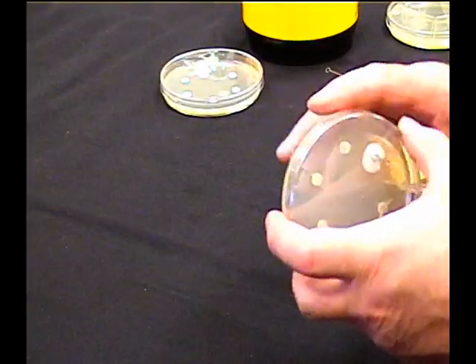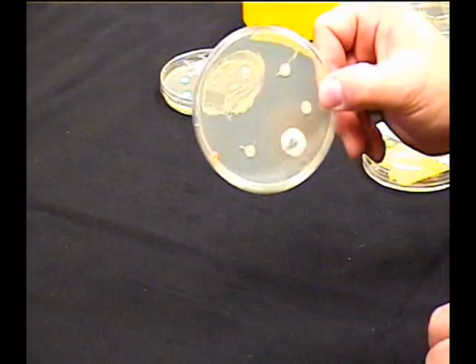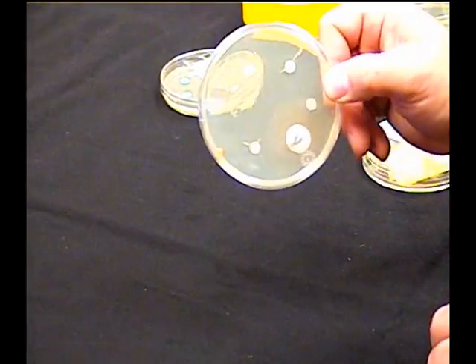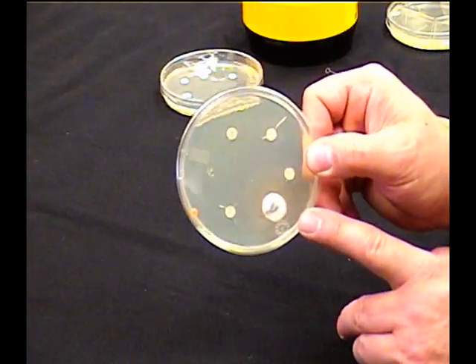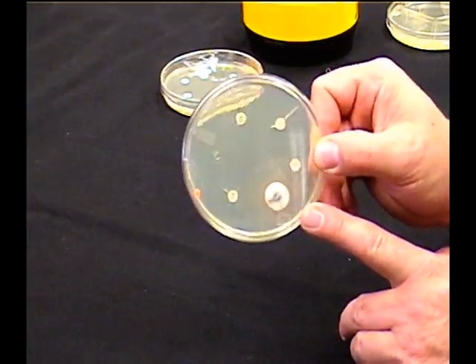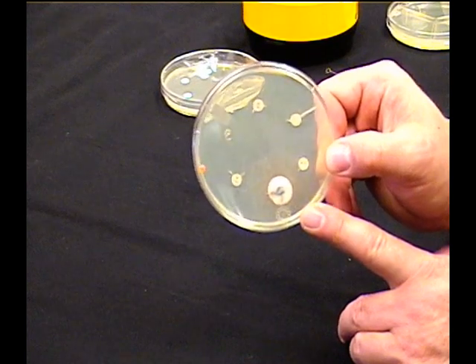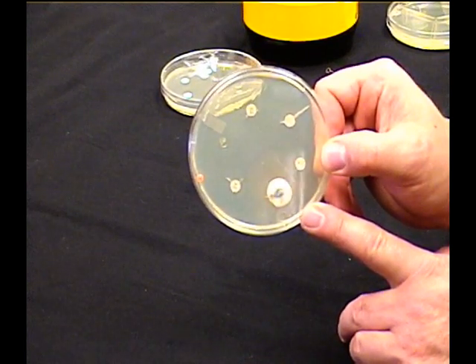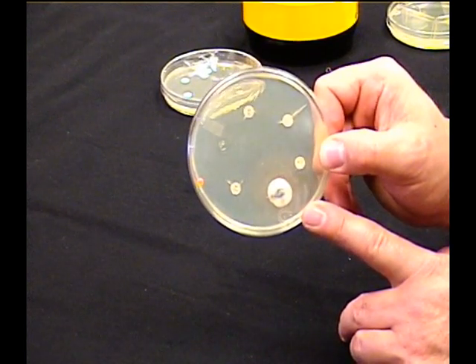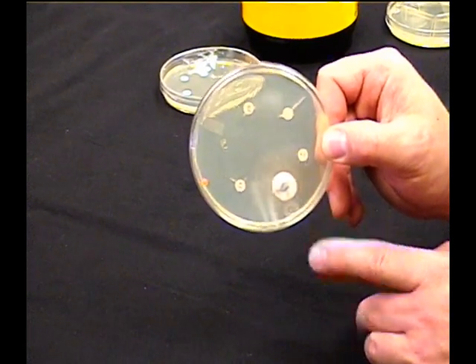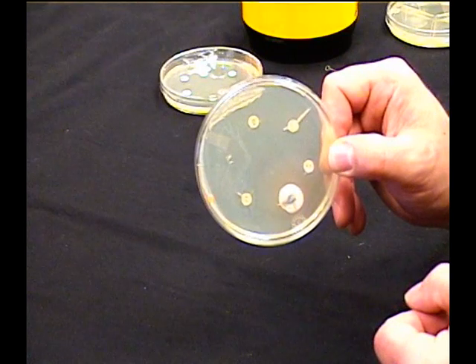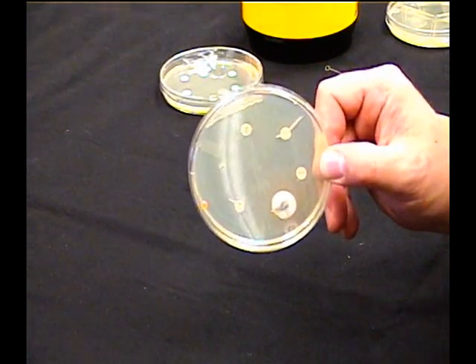On this one here, you'll notice that we don't have anything growing except for one big fuzzy, one big mold growing on this. Well, one big mold growing on this isn't going to help us much. This plate was not inoculated at all. It was just used as a demo.